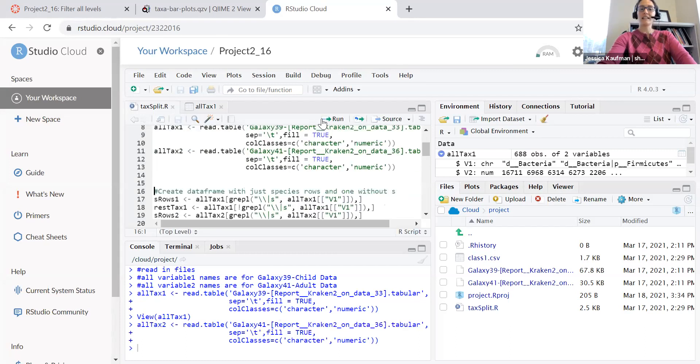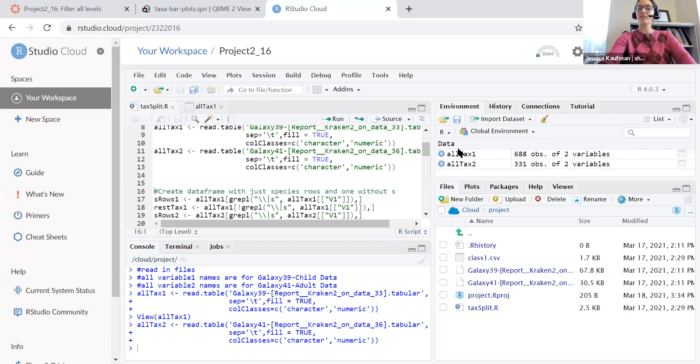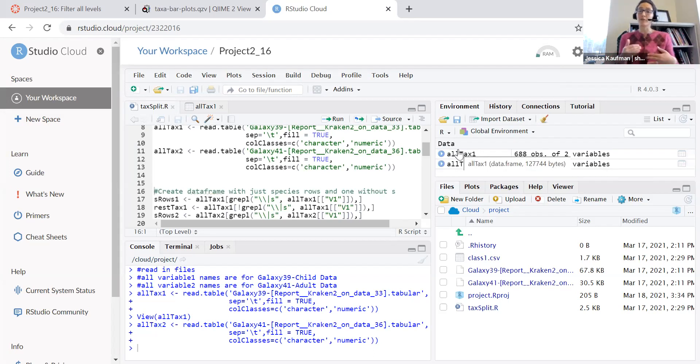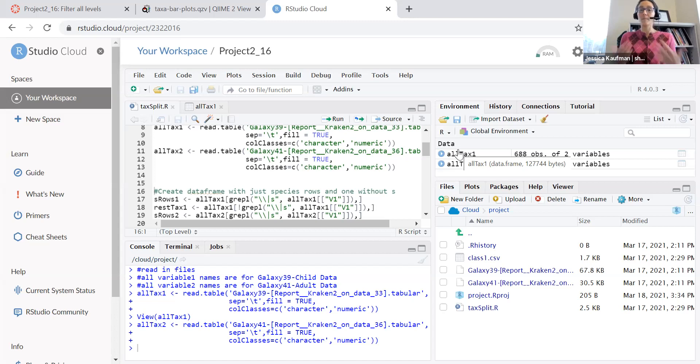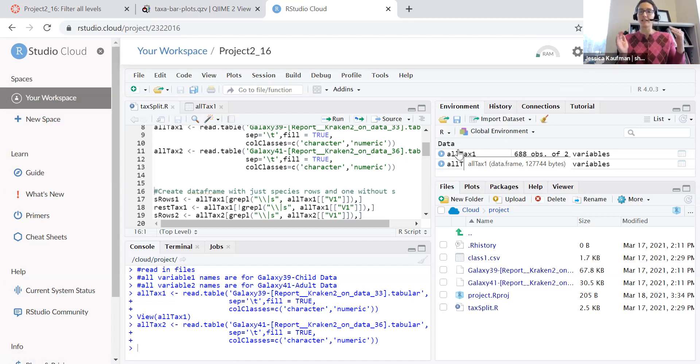Read in the second tabular file and now I have two data frames. They're different numbers of rows because there were different numbers of assignments for my two samples and now I'm ready to process them and break them up into separate files for species, genus, etc.